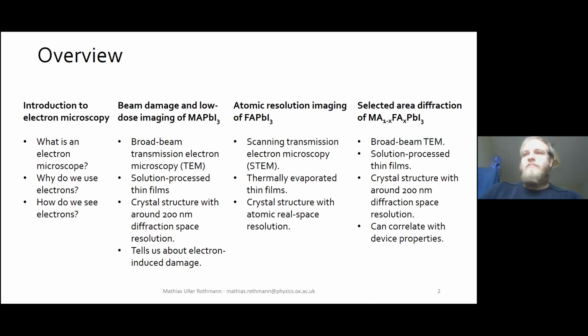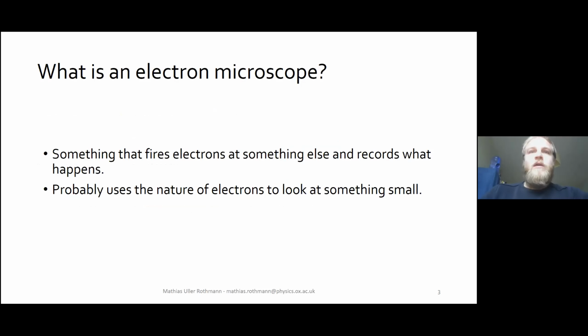And if we have some time, which I don't think we'll quite get to, but we'll see, I'll talk a bit about how we can study what happens when we mix these organic cations together using a very low dose technique, selected area diffraction, which maybe we'll get to, we'll see.